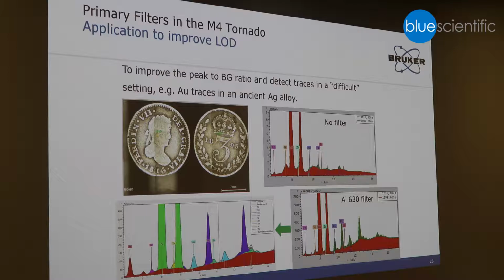If you do the analysis of the coin which got minted in 1816, indicated here, you see there's a difference. You see a difference in the spectrum already in profile. But what you also see is that you have rather high background and some peaks here, a very broadening peak, and this is already indicating that you may deal with diffraction lines.